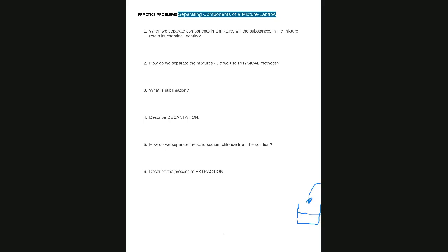We want the salt. So all we have to do is evaporate the water by heating, with the setup that I showed you before, that is in your procedure. You use the Bunsen burner. So basically you evaporate the water by heating the solution in the evaporating dish. It is on the clay triangle, on the ring stand that we saw in the picture, and we use a Bunsen burner. And that's all we have to do before we weigh the grams of sodium chloride.